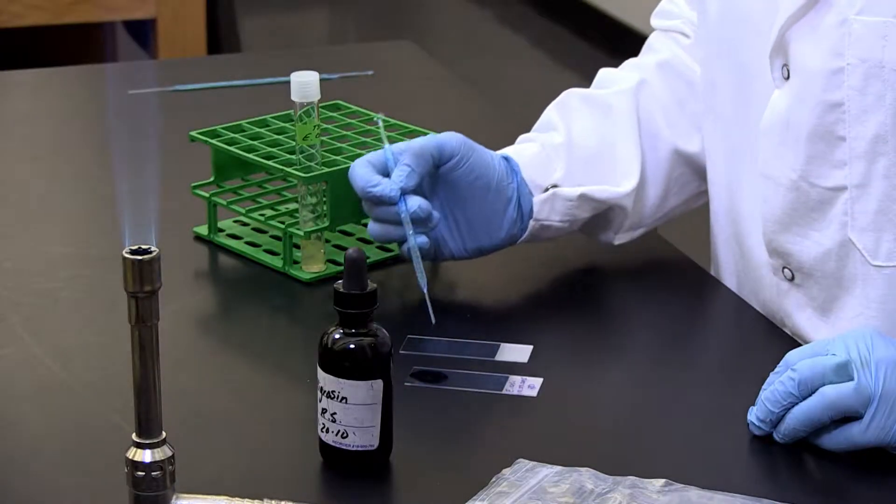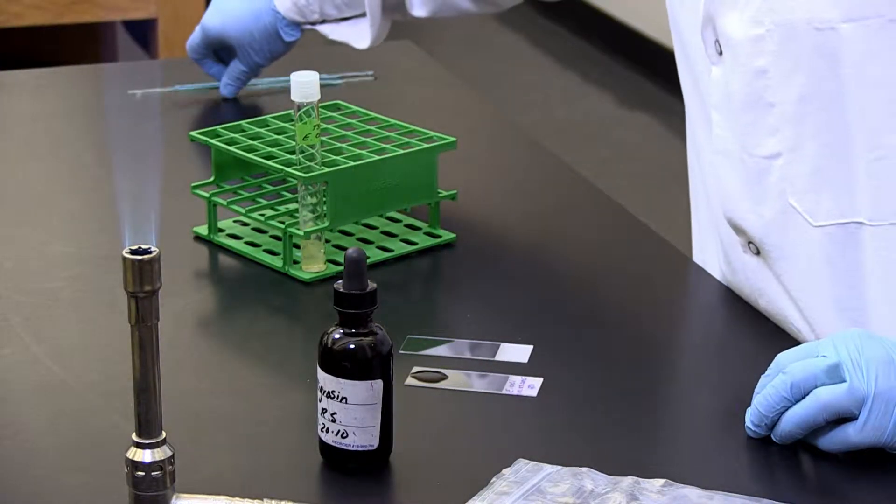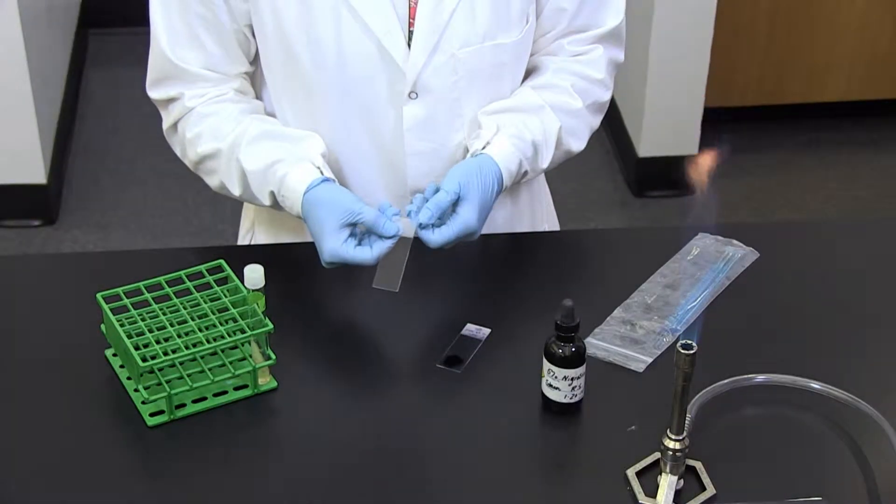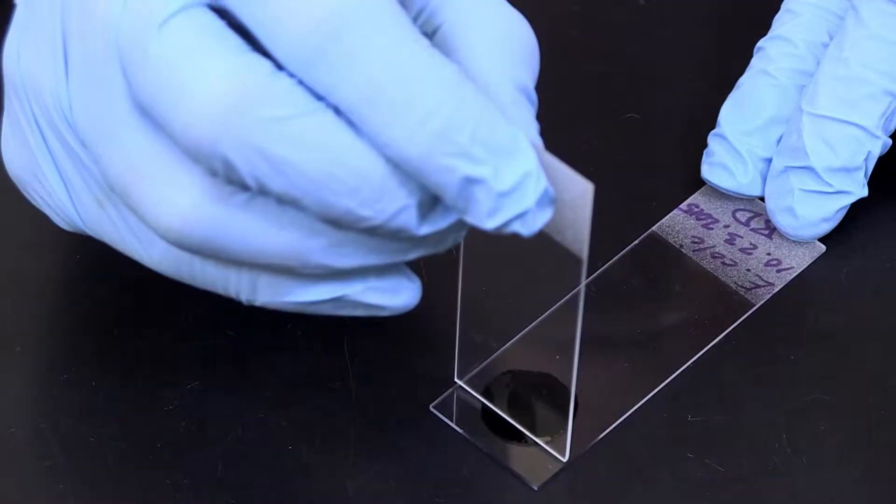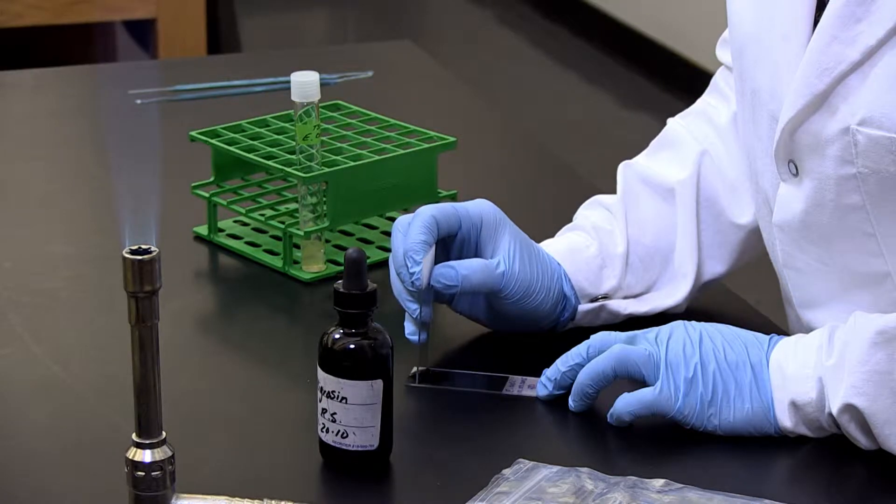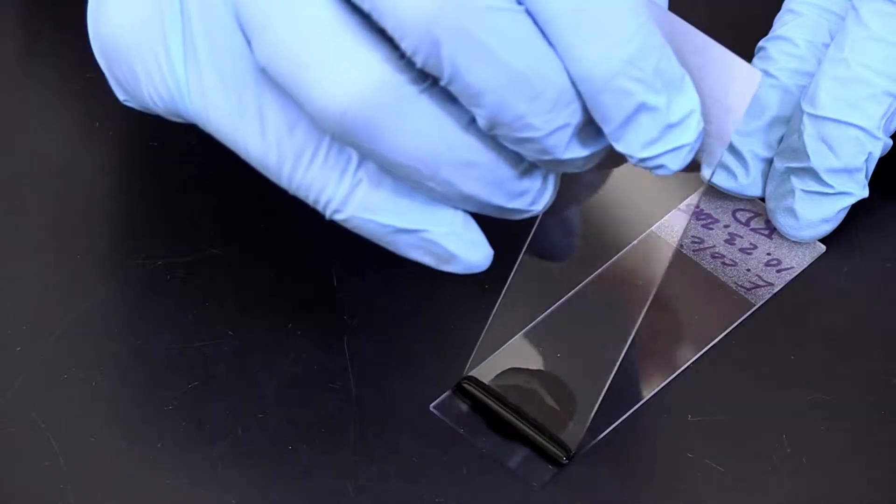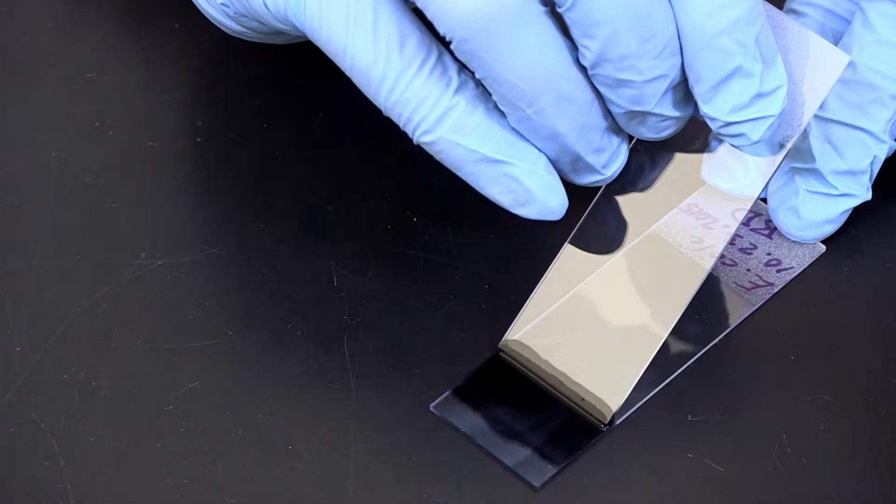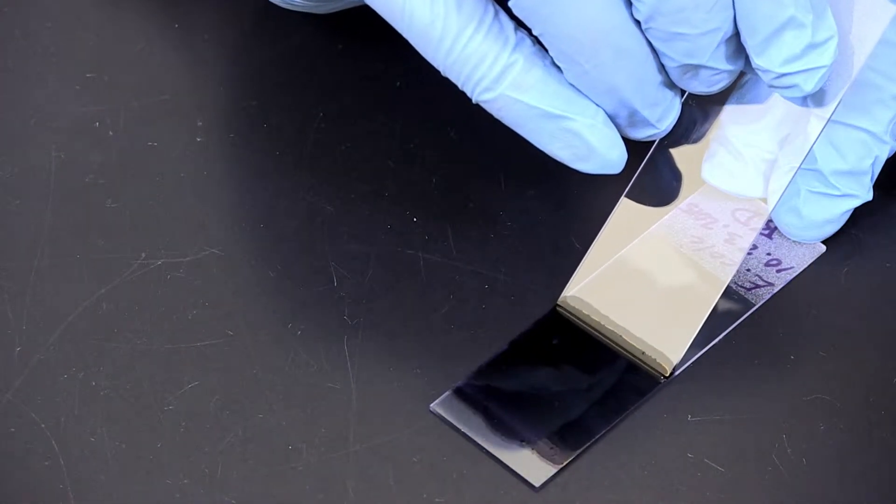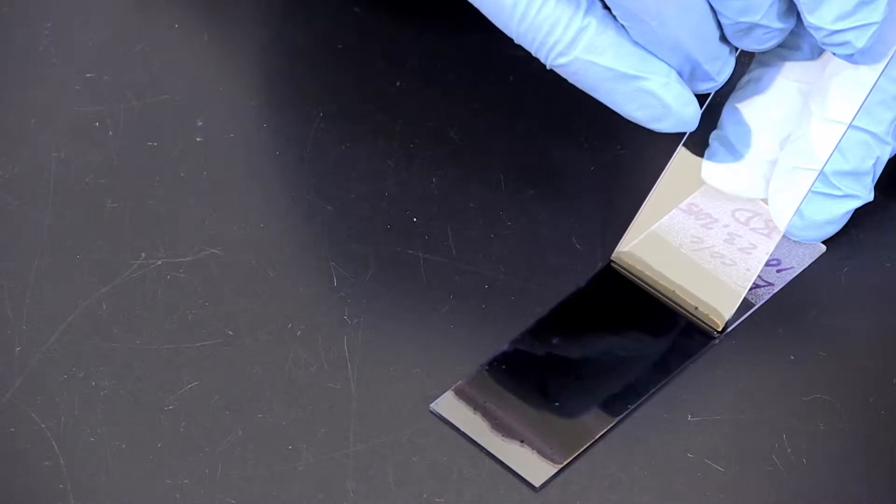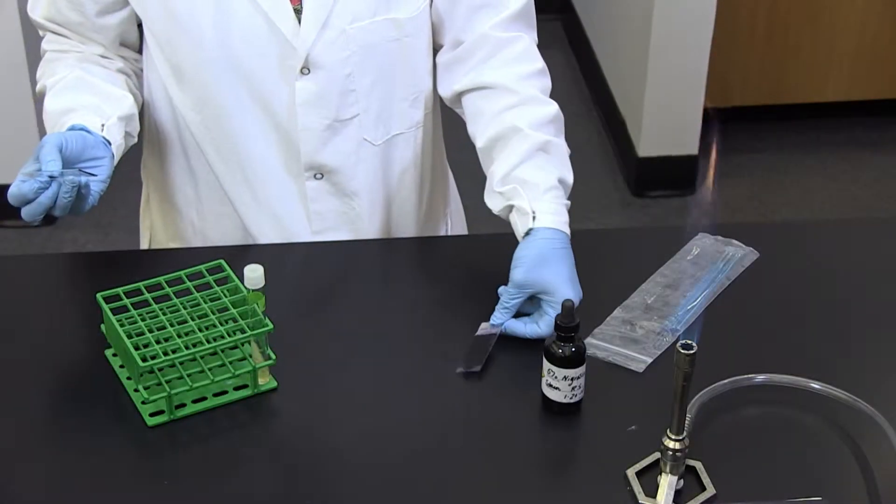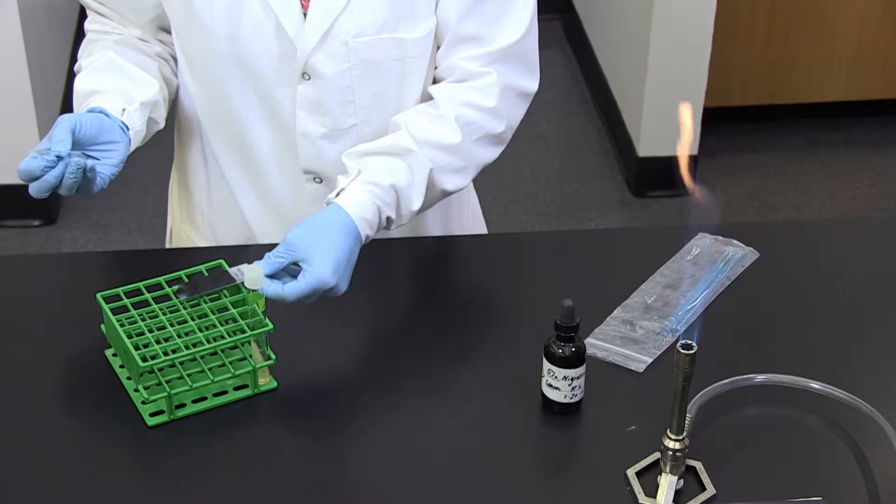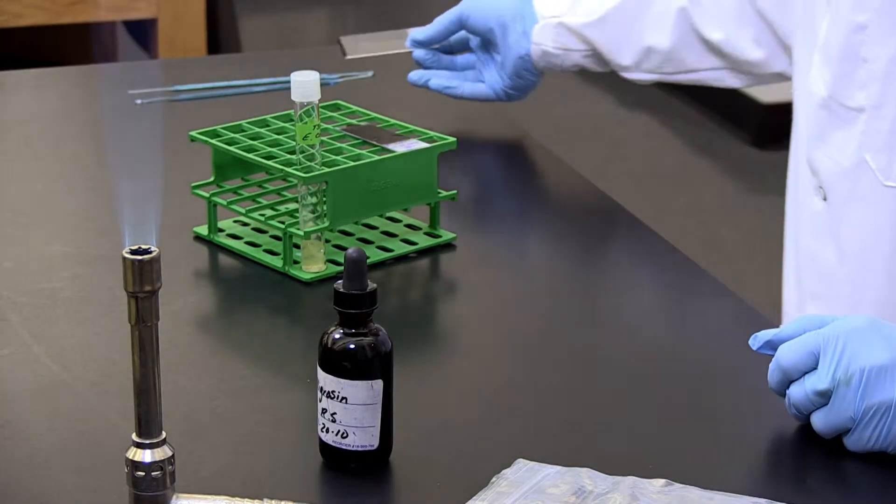Three, place a second slide in front of the drop and move the slide backward until it touches the dye, spreading the dye across the trailing edge of the spreader slide. Four, slide the spreader slide forward, dragging the suspension of bacterial cells across it. This should result in a smear that is quite thick at one end and very thin at the other. Five, allow the slide to air dry for five to ten minutes. Six, examine the slide under oil immersion.